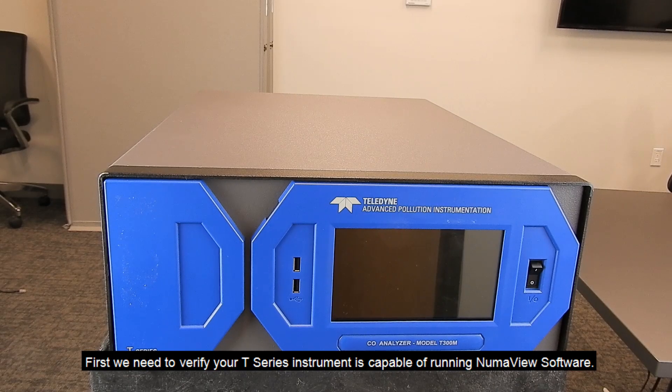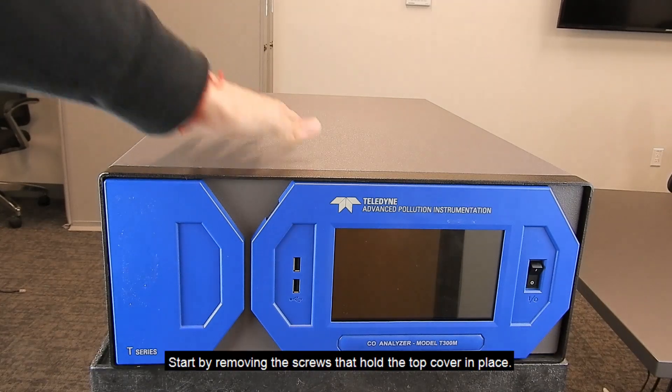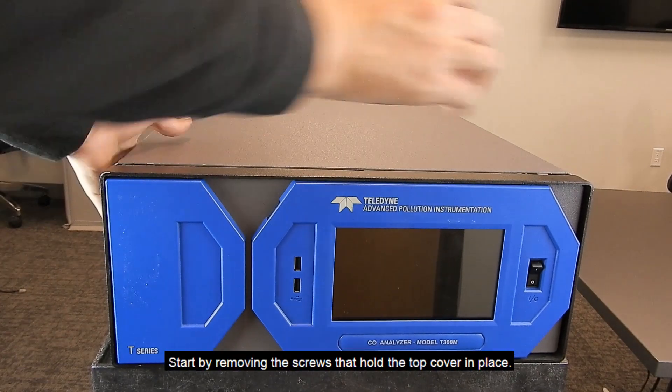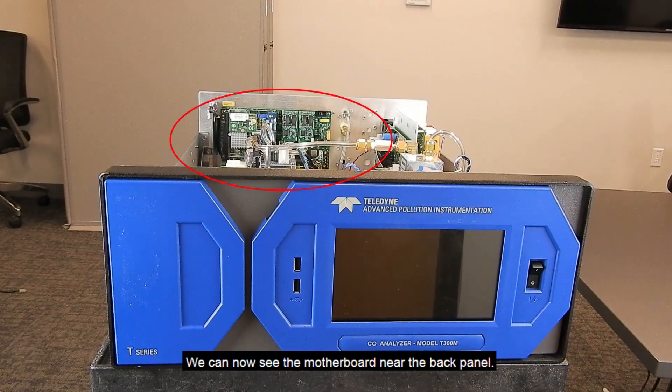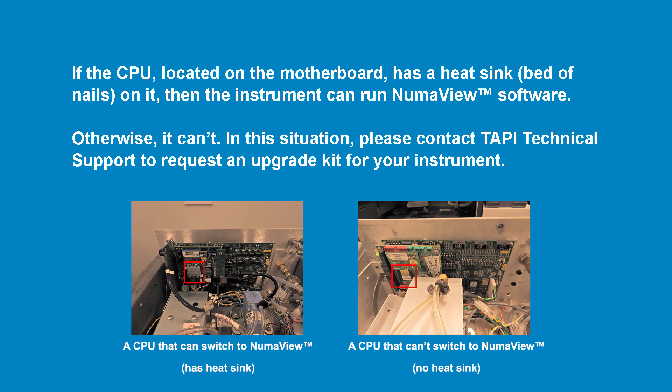First we need to verify your T-Series instrument is capable of running NumaView software. Start by removing the screws that hold the top cover in place. Slide the cover back and then remove it. We can now see the motherboard near the back panel. If the CPU, located on the motherboard, has a bed of nails heat sink on it, the instrument can run NumaView software.